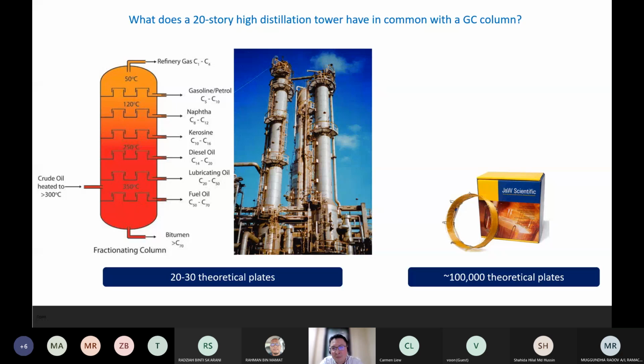But when you look into the capillary columns, which are much smaller but also relatively quite long, they have much higher theoretical plate values, and hence give them more capability to resolve a particular mixture into their native compounds. So basically, yeah, they have theoretical plates.